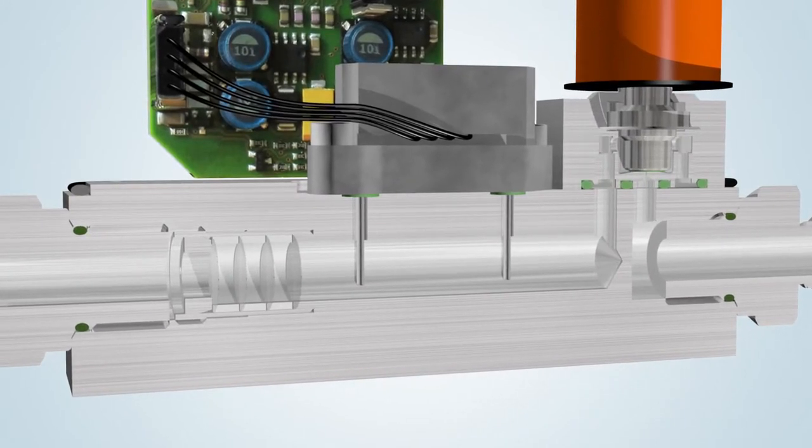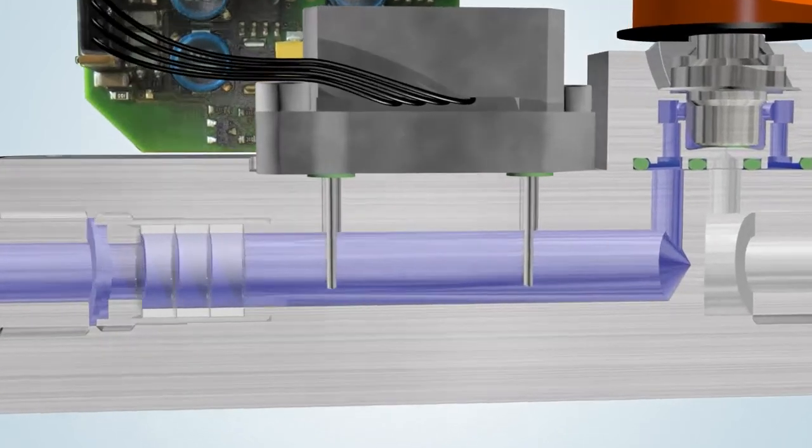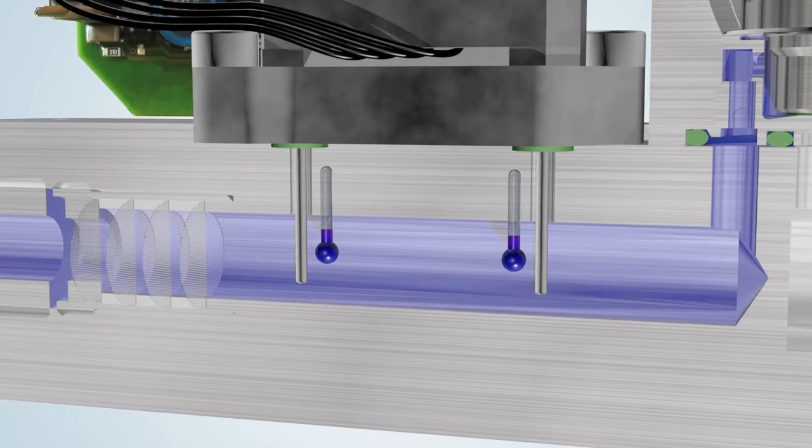Once the instrument has been connected to the process line, the pre-pressure can be set. The body is now filled with gas. The flow sensor consists of two stainless steel pins encasing the heater in the first probe and the temperature sensor in the second probe.